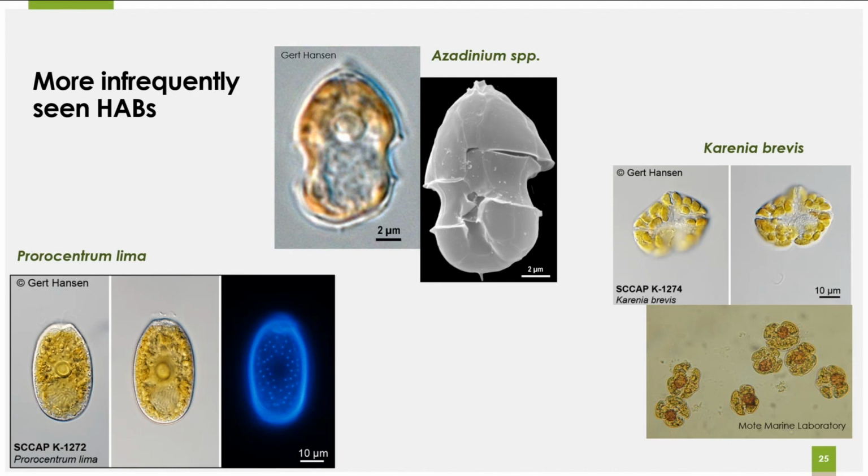saw something similar to this last week, and that was the email I sent out that I was telling you about to my colleague saying, is this Prorocentrum lima? I'm not sure. And they confirmed, or they had their opinions that it was not. So it was helpful to have that kind of community, like I said. But this is another species we monitor for.